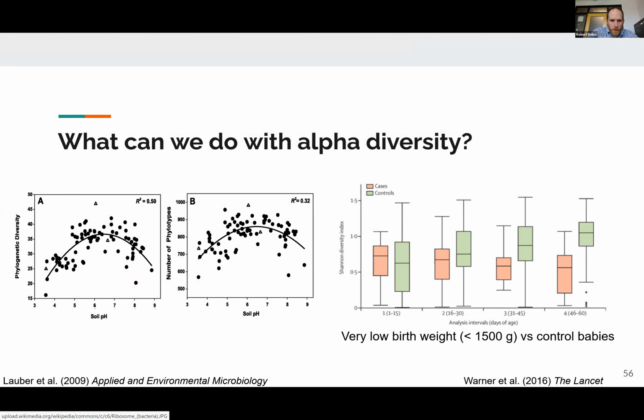We've got two figure panels there. Notice that the x-axis in both cases is soil pH. So the authors were trying to understand the relationship between soil pH and some notion of diversity, if one actually exists. On the left, we've got a phylogenetically weighted method. And this is consistent with the hypothesis where neutral pH roughly is expected to have highest diversity. According to the model fit, yes, highest around 7, maybe 6.5, drops off in either direction.